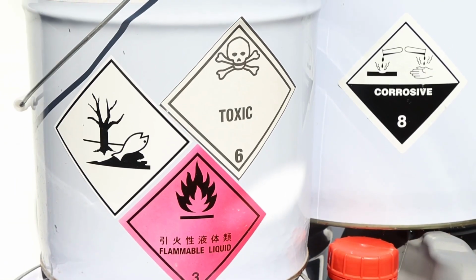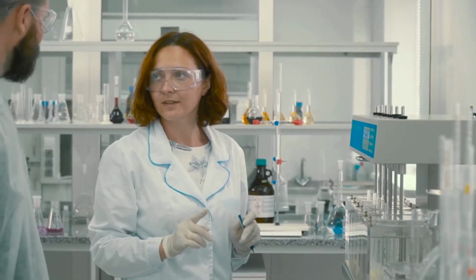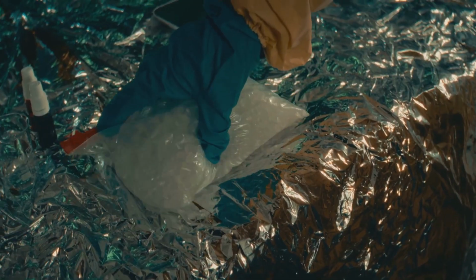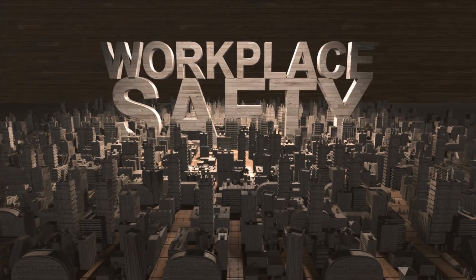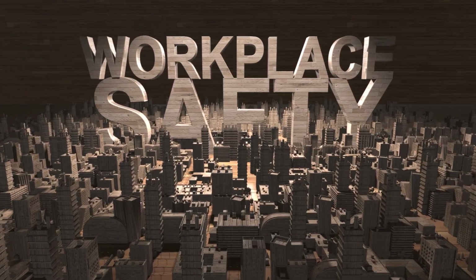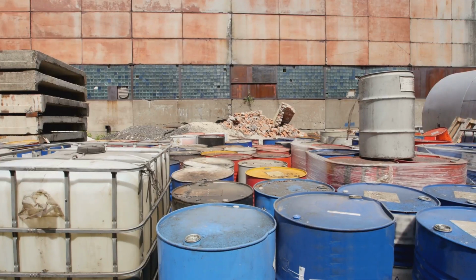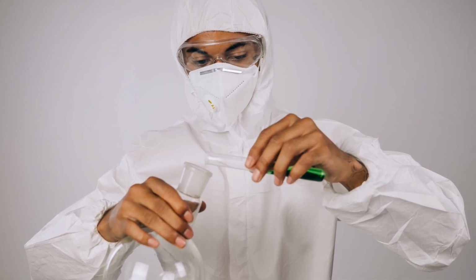These secondary hazards, long-term health issues, environmental harm, and storage risks, are just as important as the primary ones. They are subtle, but their consequences can be just as severe. They remind us that solvent safety is not just about avoiding a single dramatic accident. It's about developing consistent, safe habits that protect our health and our world over the long run. It requires thinking ahead and considering the full life cycle of the chemical, from the moment you open the bottle to the moment you dispose of the empty container. Being a safe scientist means being a responsible one too.